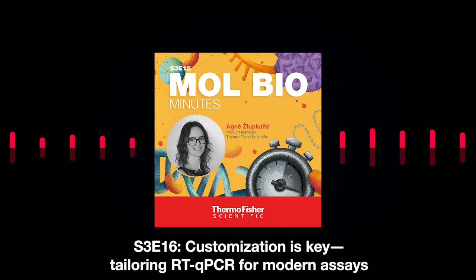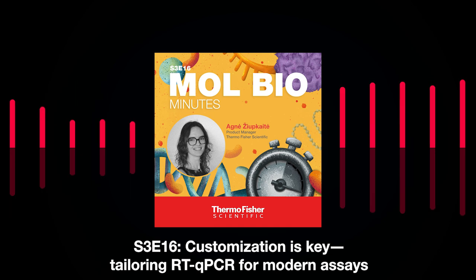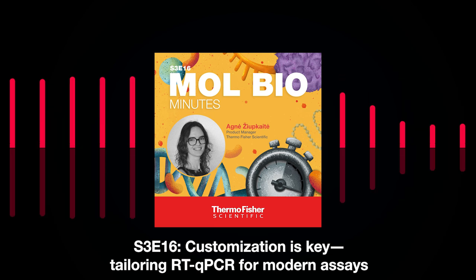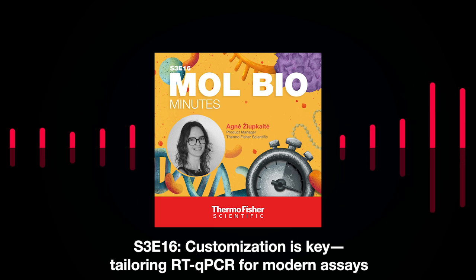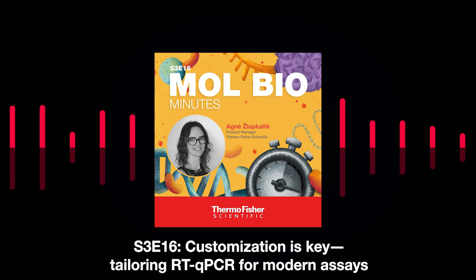The RT itself is not going to deliver your desired result for one-step RT-qPCR assay development, so don't forget to choose DNA polymerase and dNTPs that could give you the desired outcome. Not to mention that one-step RT-qPCR is not the only technology and method for molecular diagnostics, so you might consider isothermal amplification enzymes, or maybe you need modified enzymes for your assay with the commercial rights and needed support for the laboratories.